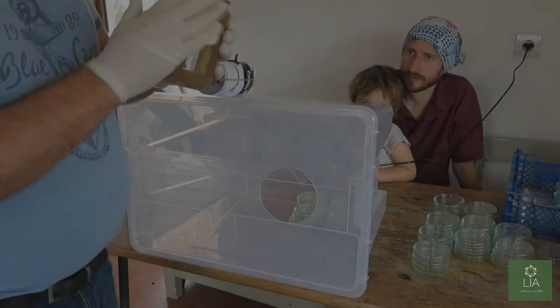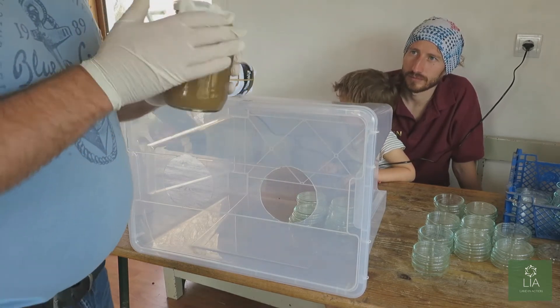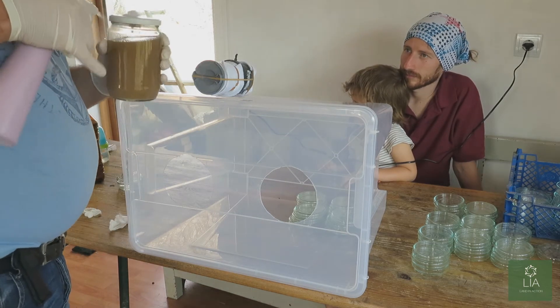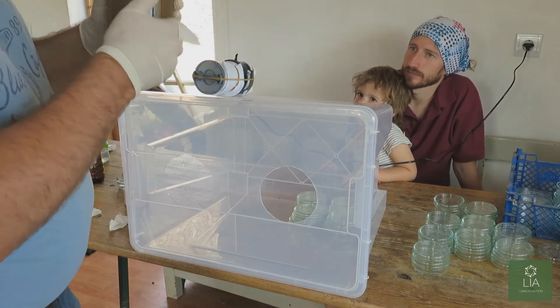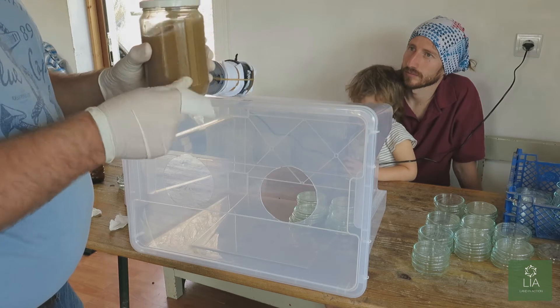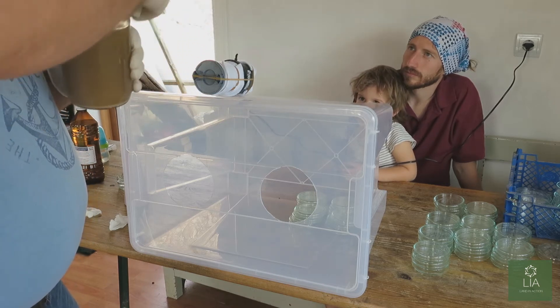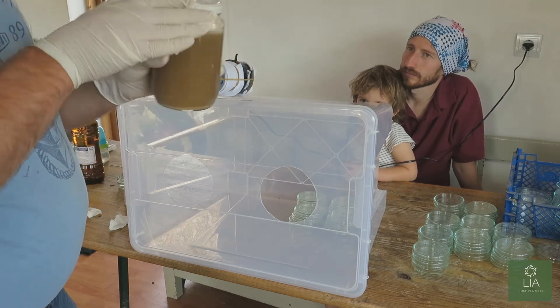So we take our jar that we just made and we're going to clean this also with the alcohol, just to make sure that everything that goes in there is clean. Just be careful with this because the jar can become very slippery. Make sure you get into these crevices because that's where you're going to reopen it from.